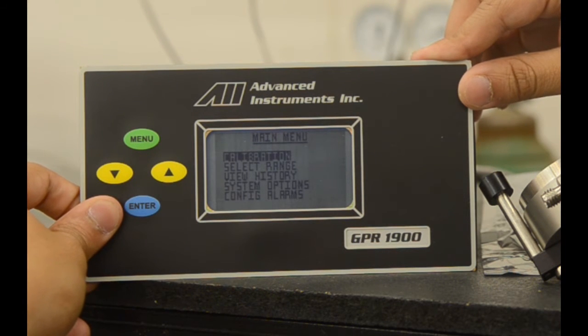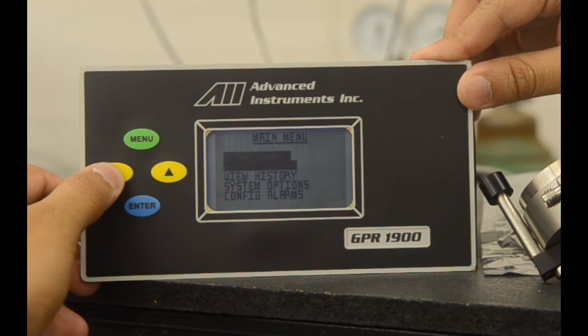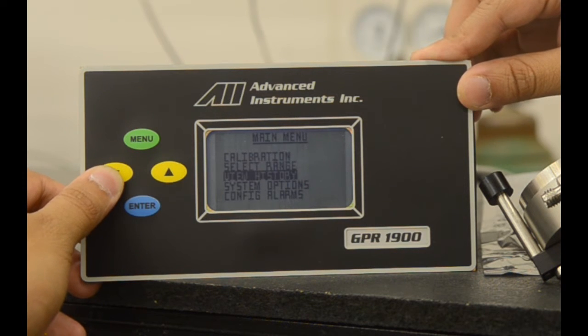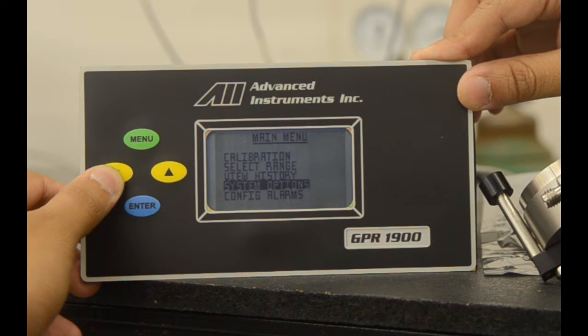There you'll have the options of calibration, select range, view history, system options, and configure alarms.